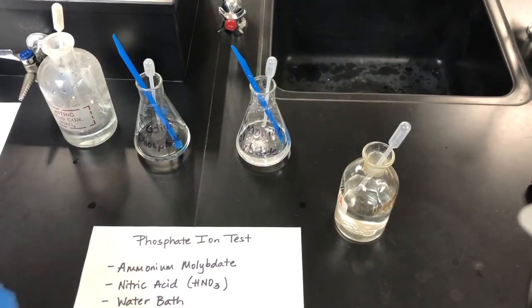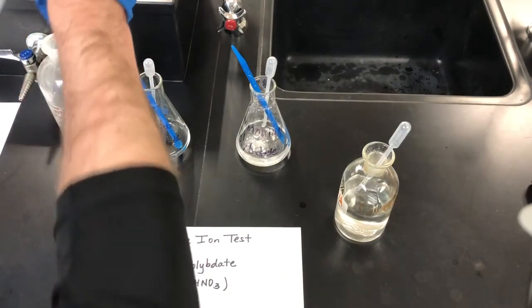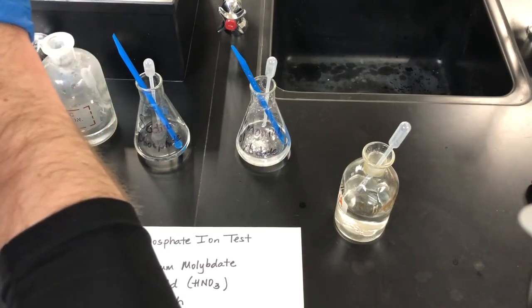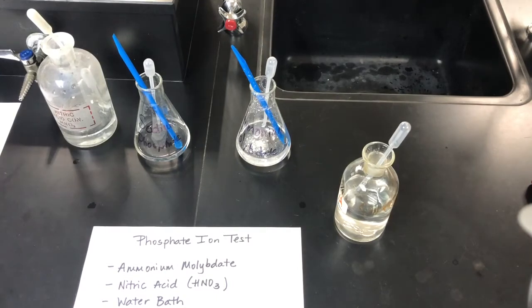It says we're going to do 1 to 2 milliliters of nitric acid, and we are going to put it in the water bath. So we'll come back and we'll look at the results in just a second.